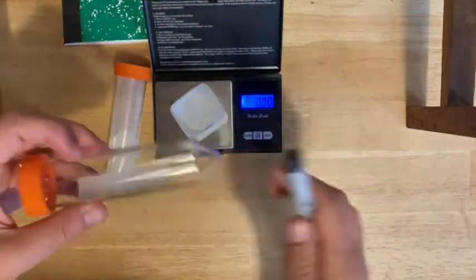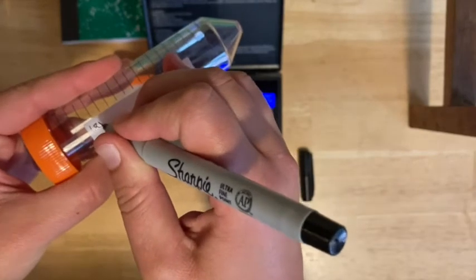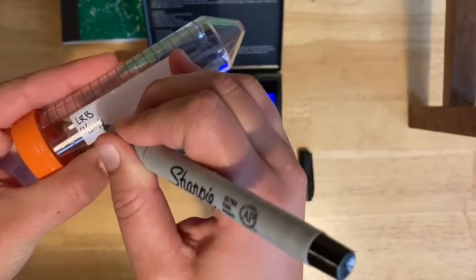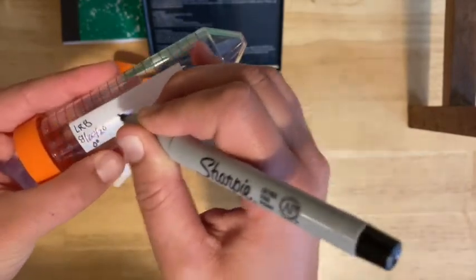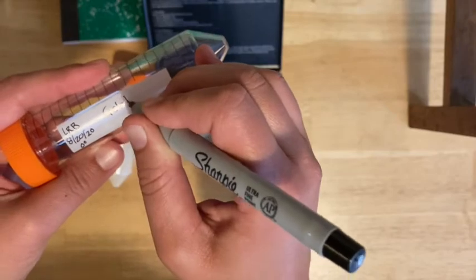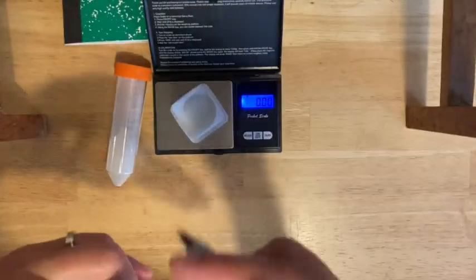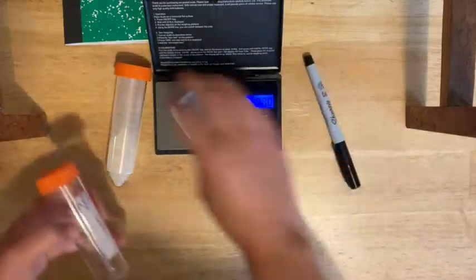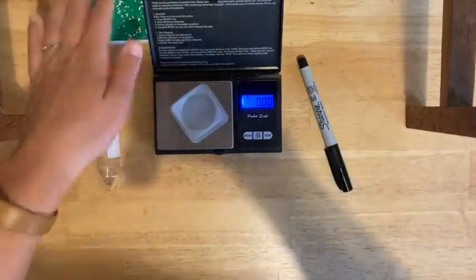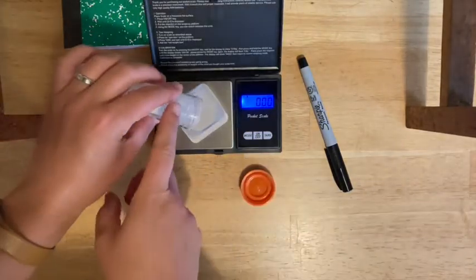You want to label your tube — don't forget, you always want to label your tube before you put anything into it. So initials, date, whatever that happens to be, your class period, and then what's in here. This is going to be just gelatin. Standard recipe, so you don't need a concentration. Then you're going to weigh out the correct amount. This should all be in your notebook — if you forget the amounts or what you're doing, always refer back to your notebook.